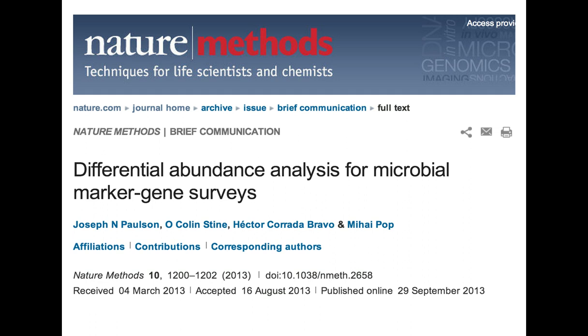there are a lot of distributional characteristics that are innate to the data that just really don't convey the characteristics of the data, right? So we needed to develop novel approaches, both normalization, so I'll go over normalization, and the actual testing framework for testing whether a bacteria is more abundant in one group versus another, and estimating more robust fold change estimates.